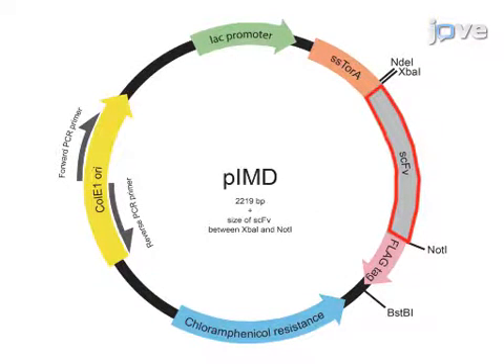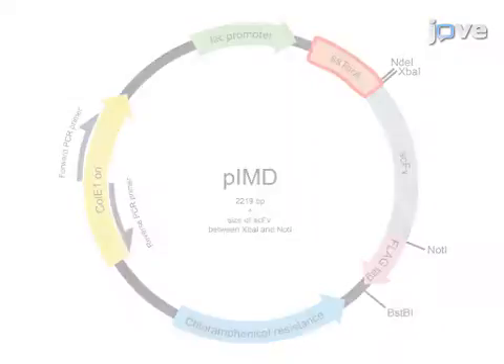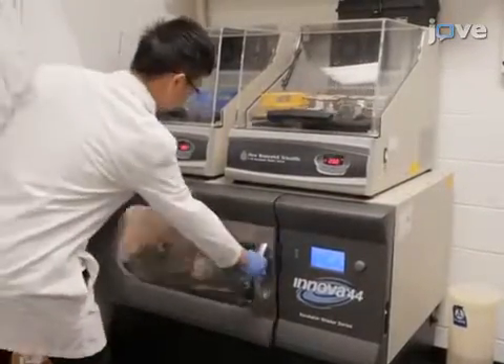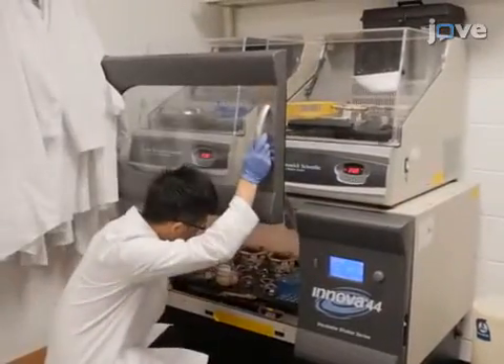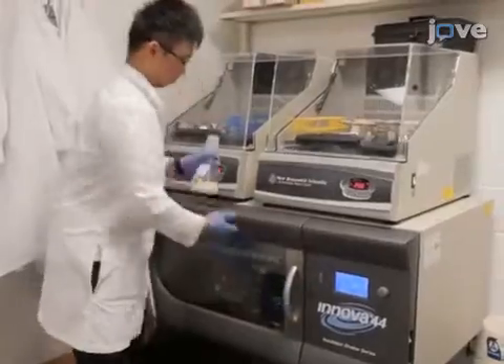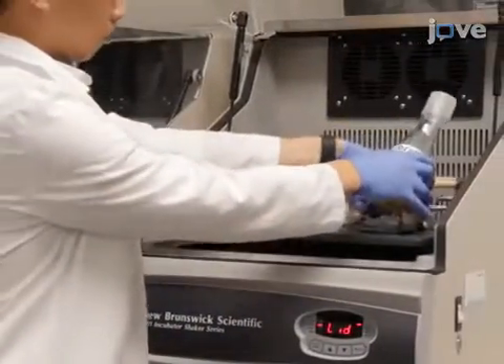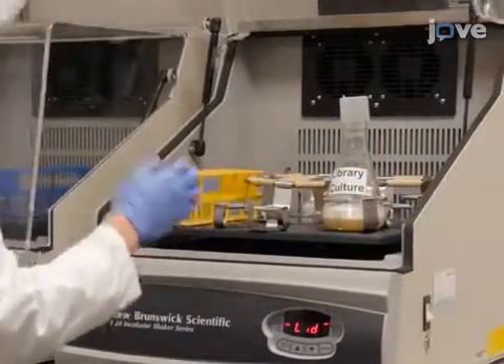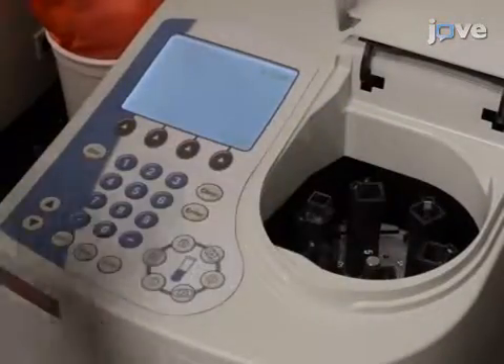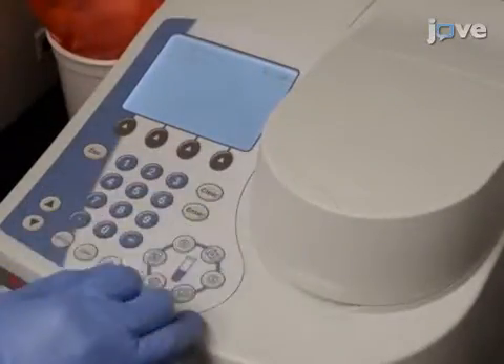After fusing the SCFV library to the SS-TorA signal sequence and growing it at 37 degrees Celsius with shaking for 3 hours, allow expression of the SCFV library at 20 degrees Celsius and 225 RPM overnight for 15 to 22 hours. Following the incubation, use a spectrophotometer to measure the optical density at 600 nanometers.